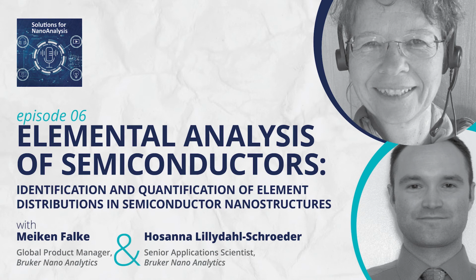Yeah, so that was about nitrogen and related overlaps. And now you also asked about doping of semiconductor materials with elements such as boron, phosphorus, arsenic, and there are more, I think. All of these elements can be identified and quantified by EDS. To which level or minimum mass fraction, to use the right term, depends on the combination of microscope and EDS technology.